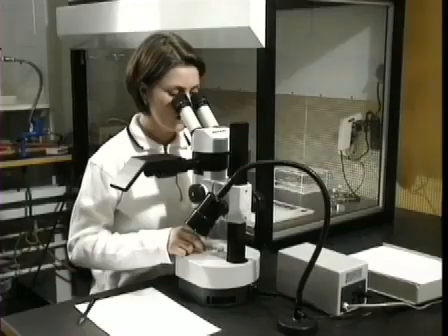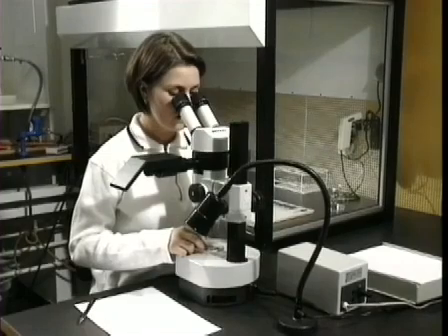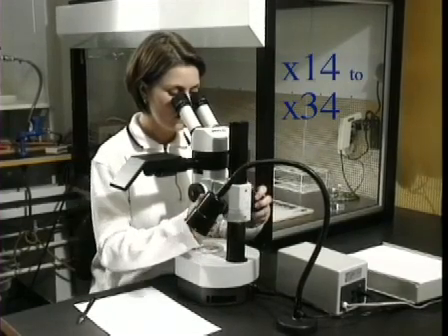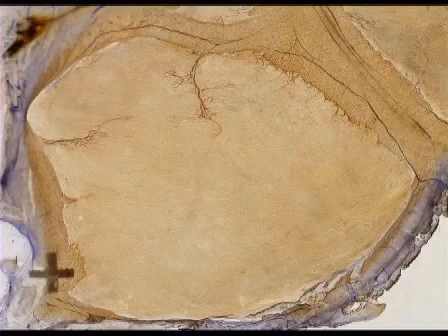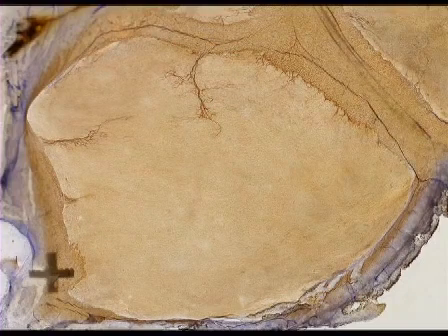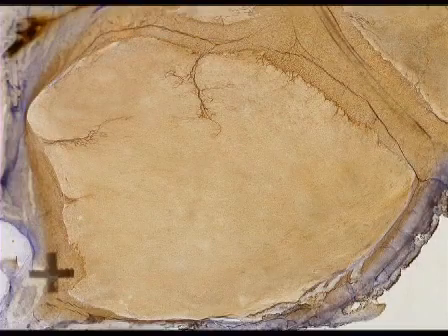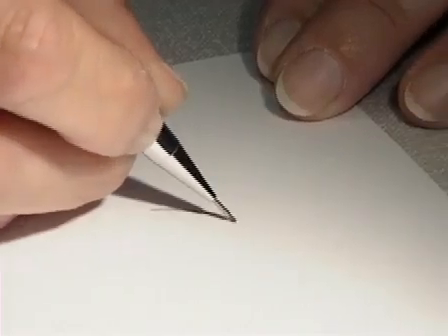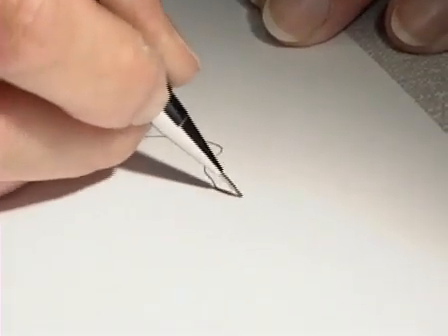Using a drawing microscope with a total optical enlargement of between 14 and 34, the entire mesenteric window is visualized. The enlargement is chosen in fixed steps so that as much of the view field as possible is covered by the specimen. The whole area of the window is easily depicted as the border between the window and the surrounding fatty tissue is distinct. All the vascularized parts are then drawn according to carefully defined criteria.